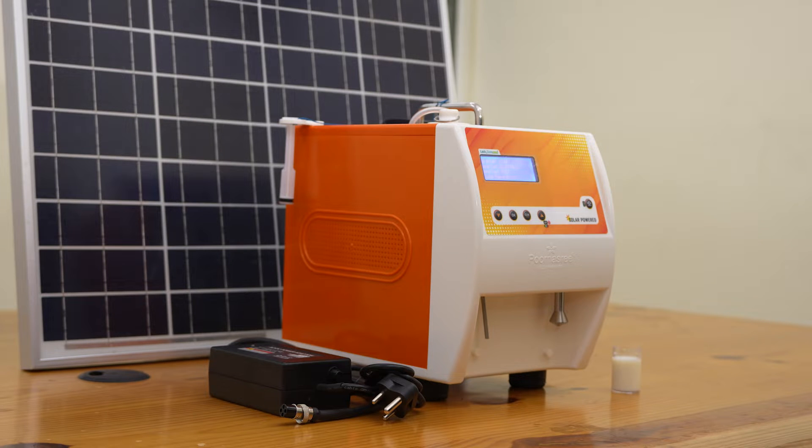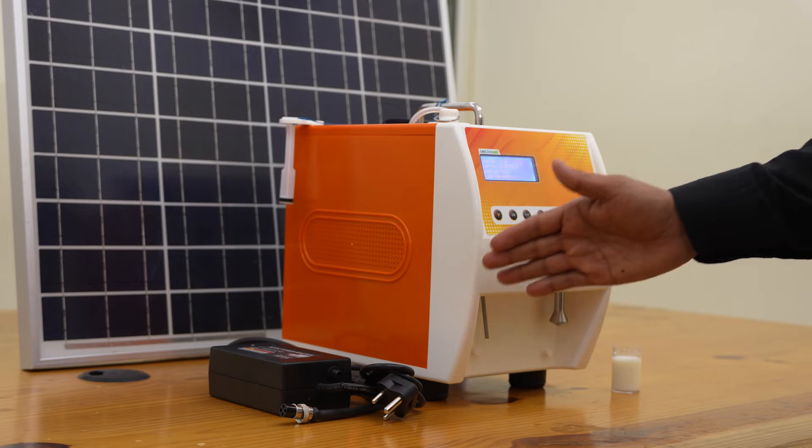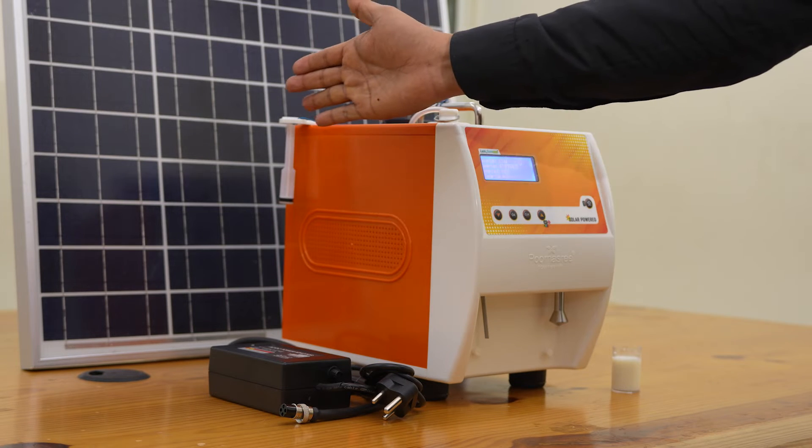Lactosure Eco SV bundle contains the inbuilt battery analyzer section, sample cup, charger adapter, and the 50 watt solar panel.